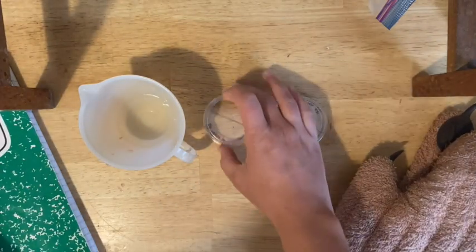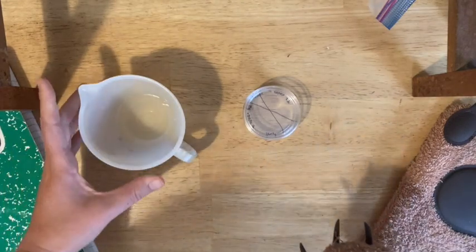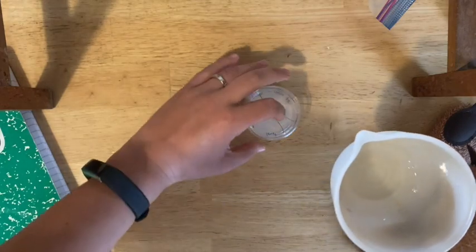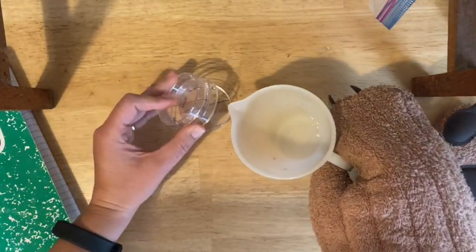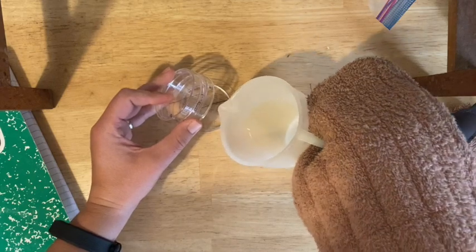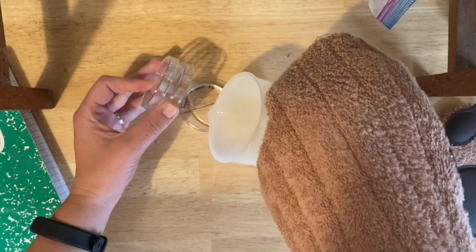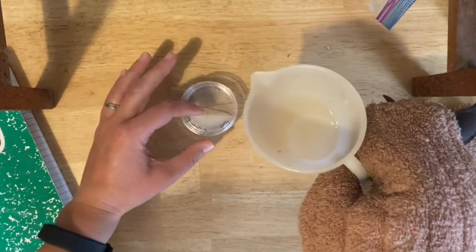Stack the plates up and pour your agar. You may find you still need your hot hands — check that it's not too hot. Crack open the bottom plate barely, keeping it closed as much as possible. Pour in just enough agar to cover the bottom of the plate. If it doesn't quite cover, close it and swirl a little to get it to cover the last bit.